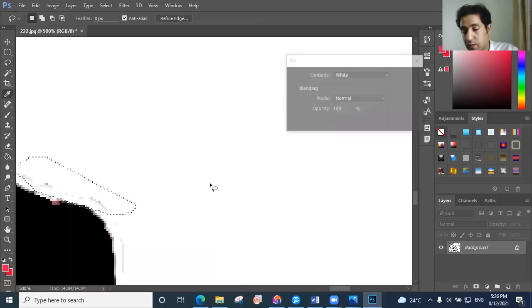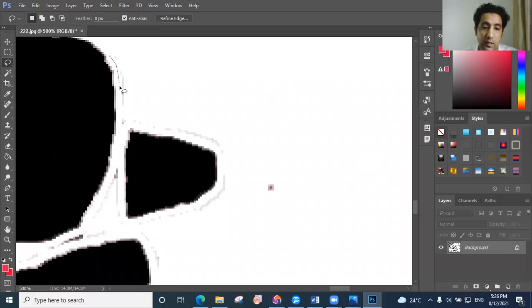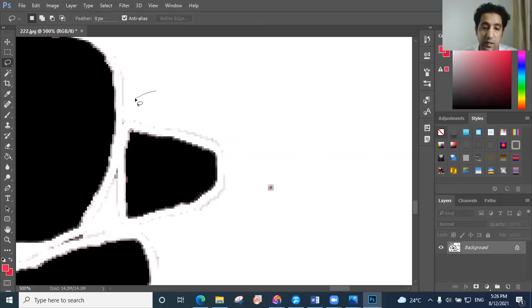All right. Okay. Just keep going. See here, don't cover the grain and just go back. All right, don't need to do this. Click again, and we need to delete only around the grain.